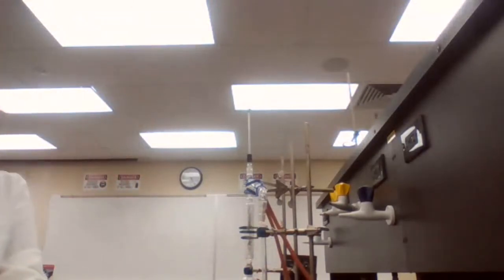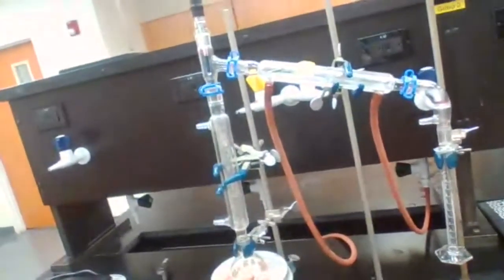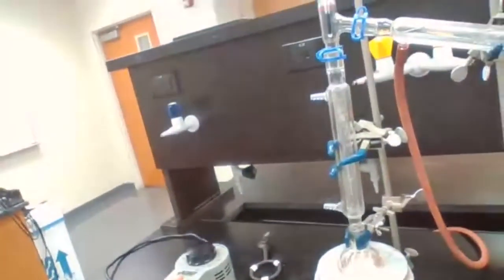Now, the fractional distillation setup is ready. The difference is that I added this fractionating column here. We are using a heating mantle. We are using a power regulator.